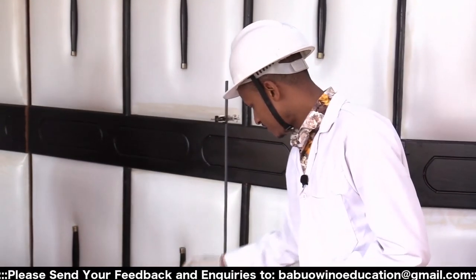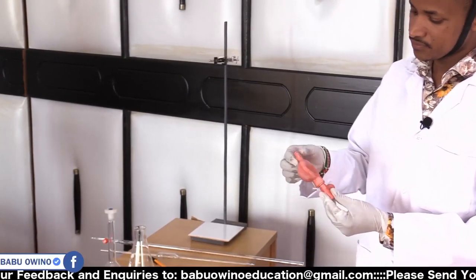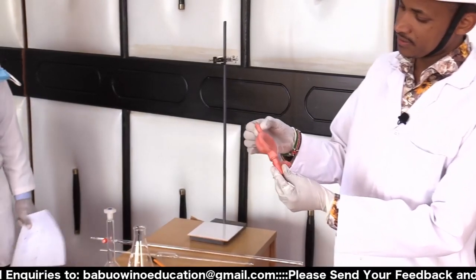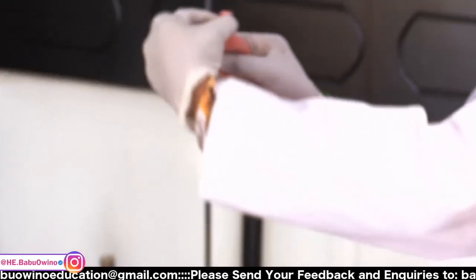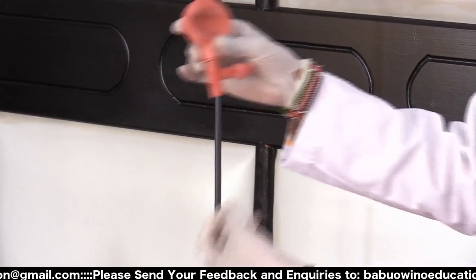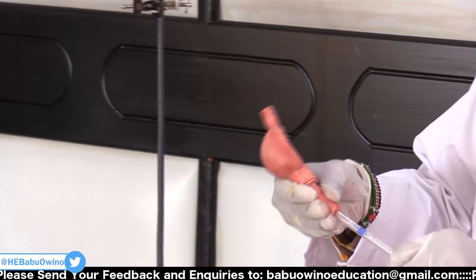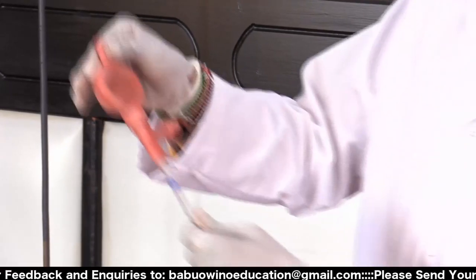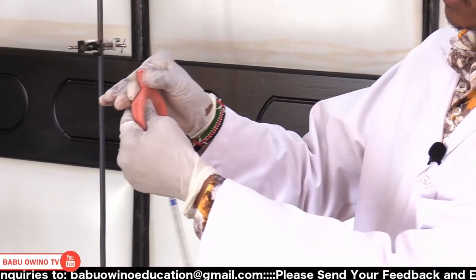Here we have the pipette sucker. The pipette sucker has various areas. Here is basically to release. When you want to release air from the pipette, you press up here, and then simultaneously you press them together. You release the air once you connect it to the pipette, then you can squeeze it like that.